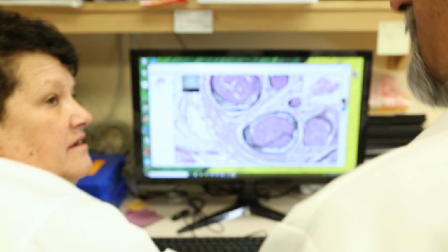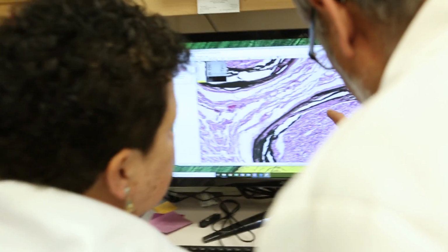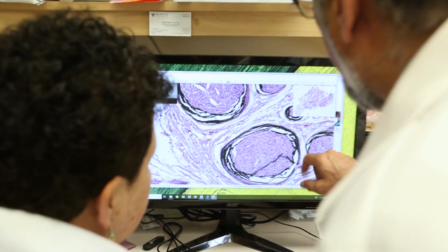So this is at a higher level of sophistication that allows us to examine brain tissues at a fundamentally important level for us to be able to make discoveries for what are the causes and hopefully find cures for conditions like Alzheimer's disease. The processor is allowing us to process any kind of tissue. It's not just set for one or applicable for one type of disease. It's just for everything and anything.